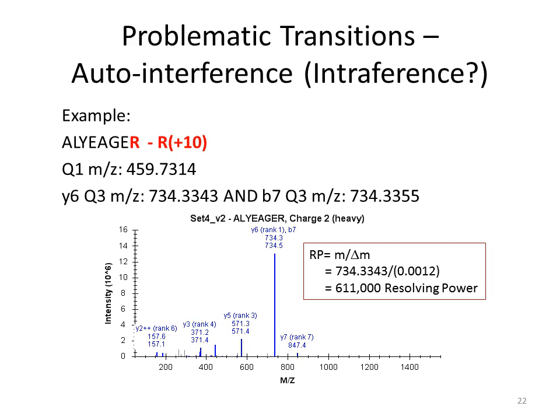So auto interference is something that people don't think about. A peptide interfering with itself. You kind of think like a palindrome word like radar. It's spelled the same forward as it is backwards. It's kind of the same way with peptides.